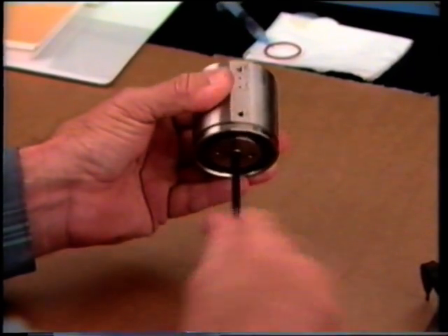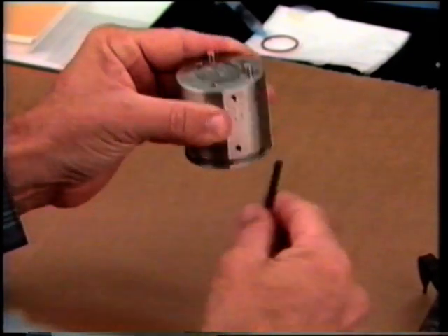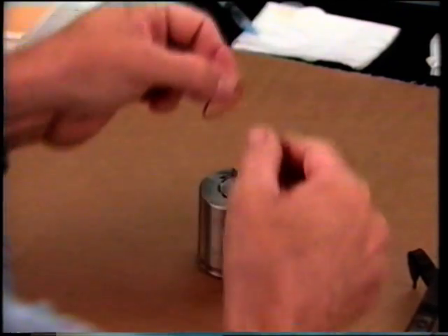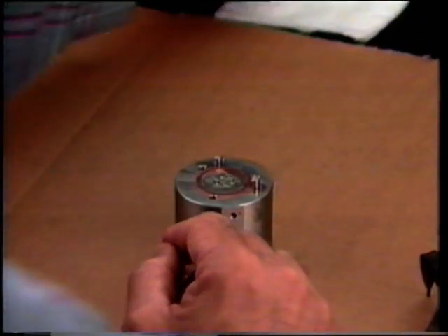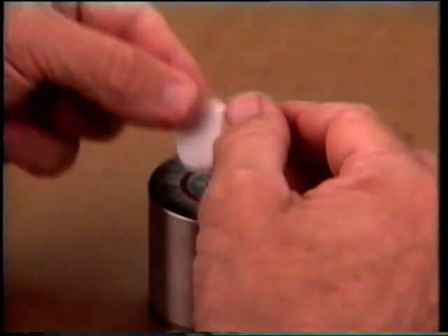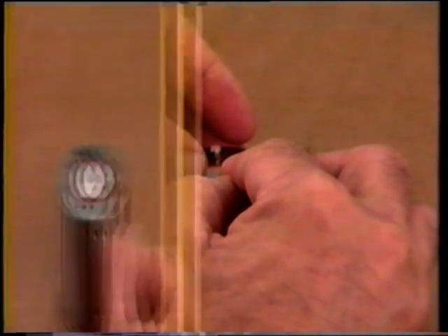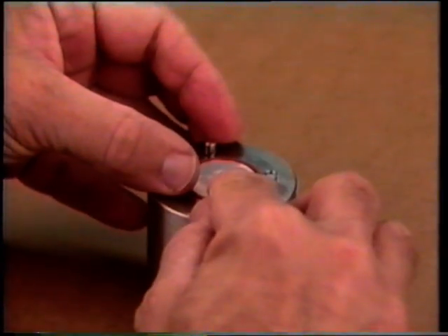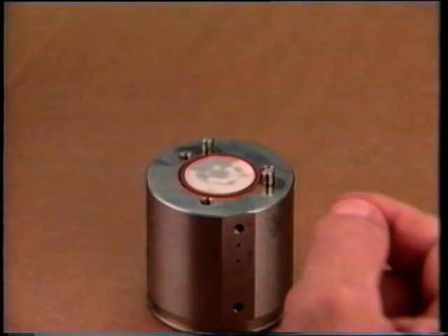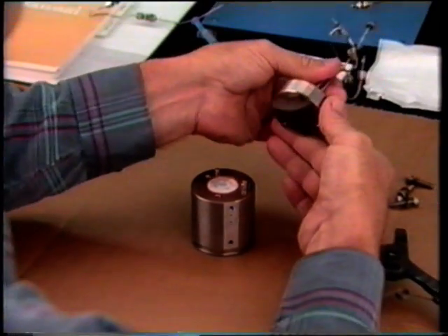Loosen the base screw so the plungers no longer protrude. This will ensure that a plunger will not cut through a disc when the valve is reassembled. Install a new, dry O-ring on top of the valve body. It's good practice to replace the cushion and seal disc whenever the valve is disassembled. Position the cushion disc on the body over the plungers and place the seal disc over the cushion disc. Make certain the discs are aligned over the plungers.